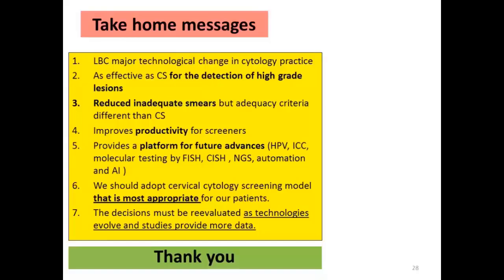So we should adopt the cervical cytology model which is most appropriate for our patients. Considering our workload and our budget, we can choose a liquid-based cytology system which is most appropriate. However, these decisions can be reevaluated as technologies evolve and studies provide more data. And now more and more literature is coming on manual liquid-based cytology and the application of these methods to non-gynae material.